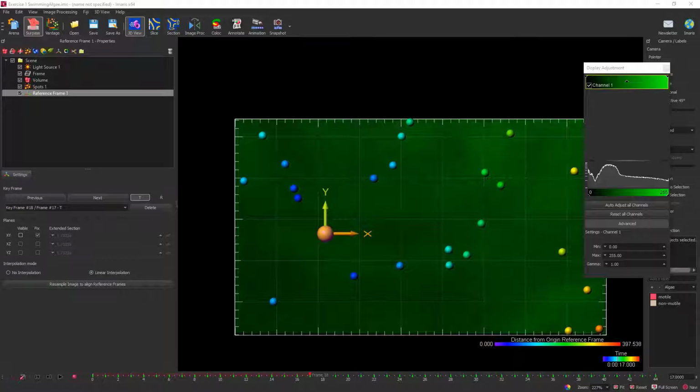Okay, awesome. So another person, Lucas, was asking about, is it possible to track single migrating cells, but those that are within a cell sheet? And so I was hoping that you could talk a little bit about object detection and what kind of objects you need to have to be able to do the tracking.